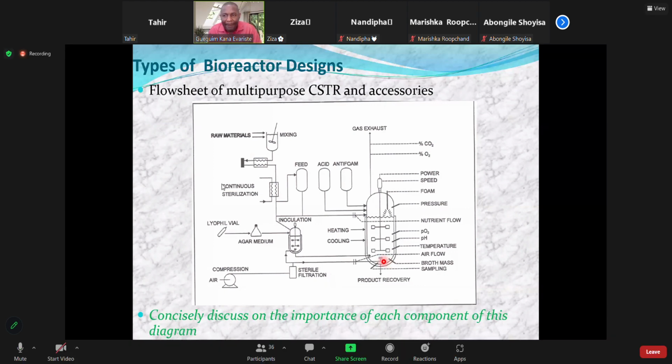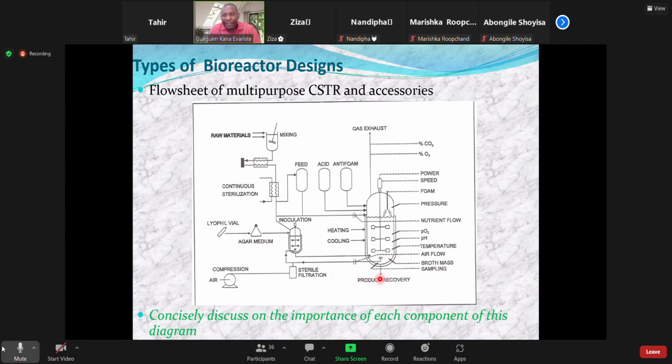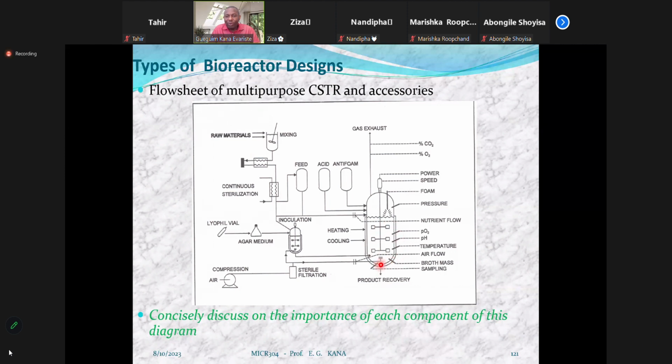Come again, Taye. Okay, that's great. Taye, you're correct. The idea here is that these blades would be able to break the bubbles of oxygen and enhance oxygen transfer. Remember the requirement of the reactor: there has to be suitable oxygen transfer. That is, the concentration of dissolved oxygen is properly enhanced, because these impellers need to break the bubbles of air provided by the Sparger. That's why you place it below the impellers.